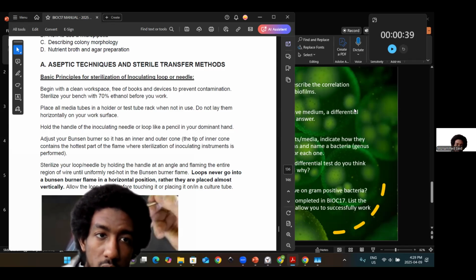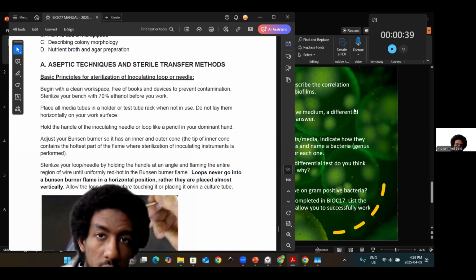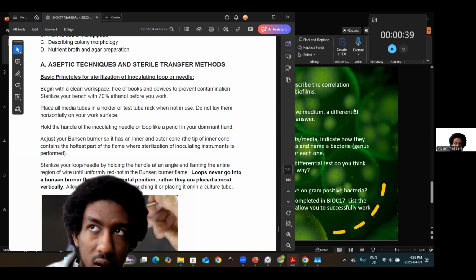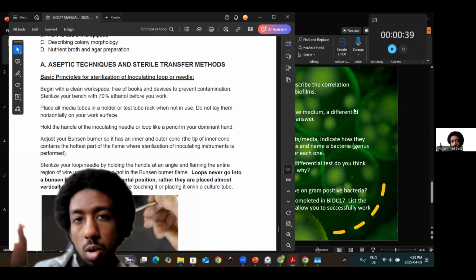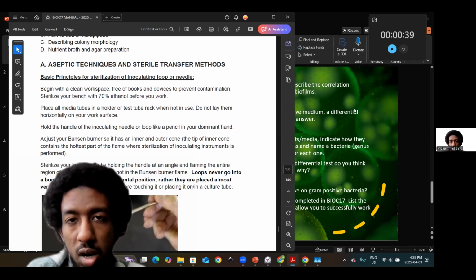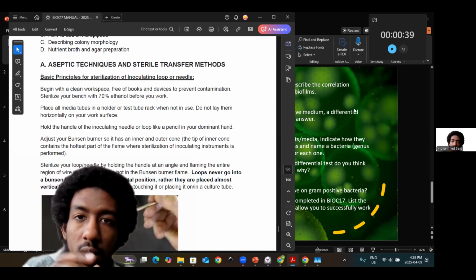Very important, right? If you don't follow aseptic technique, how well can you perform any sensitive experiments, or other techniques that we've learned thus far? Or if you didn't add in the right volumes or you didn't resuspend your bacteria, right? These are things I want you to think about, and the connections in which they can imply certain results in your lab exam, and maybe even in your observations from our previous exercises and labs slash practicals with each other, right? So think about those details, and with that, describe your conclusions, understand what you expect.